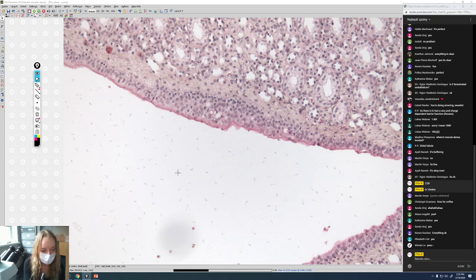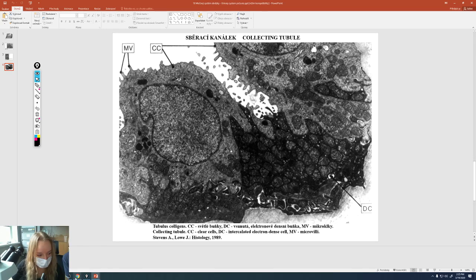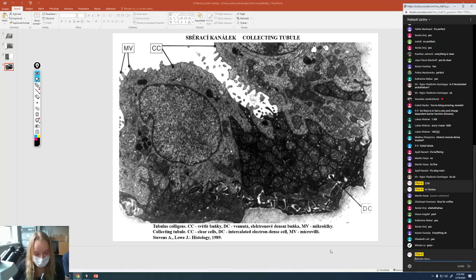Okay. So, you already asked about macula densa, yeah? So we're going to look at the last electron micrograph because it is also a collecting tubule or duct. Yeah. Me? Yeah, you can describe it.